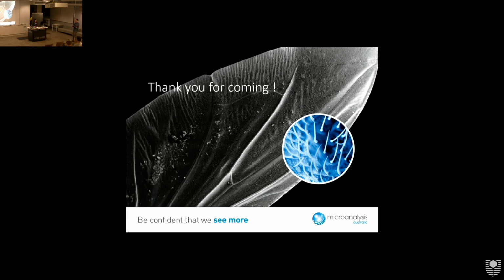We have a policy where the receptionist no longer opens any kind of parcel, after people started sending us asbestos in envelopes without any other kind of seal on it. So we take all of our samples into a fume hood and make sure we're wearing PPE when we open them up. Most of the time you can just have a look, and if it's fairly dry, it's not a huge problem. We'll just stick it in the SEM. Being microanalysis, we deal with very small amounts of sample as well. But it's a case of treating every single sample as hazardous. If you go into our sample receipt, you'll see every single box has unknown hazard on it, so we treat everything as hazardous instead of assuming that everything is not hazardous.